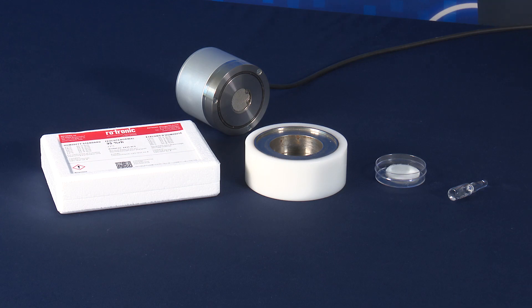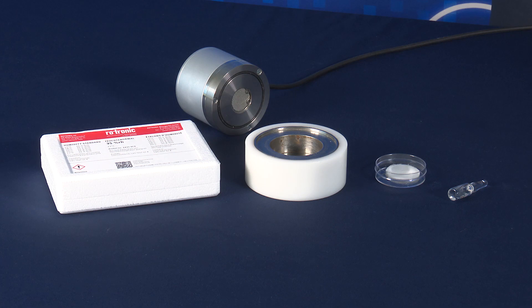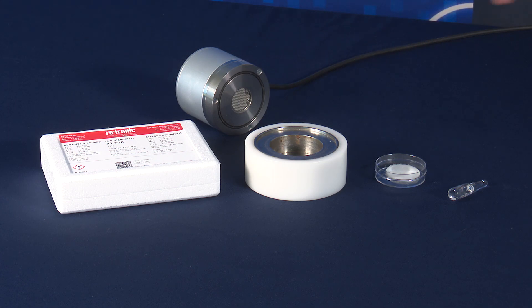The first step in the procedure is to select a humidity standard. In this case we have a 35% RH certified Rotronic humidity standard. We will select a glass ampule, a 14mm sample cup with a fiber disc pad inserted — that comes with the humidity standard — and of course the sample cup holder and the Rotronic AW Water Activity Probe.